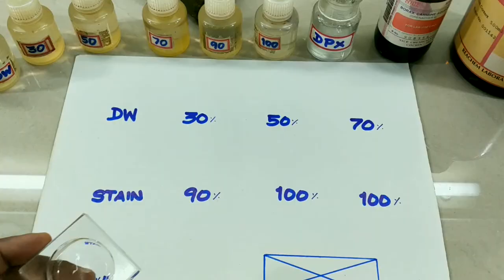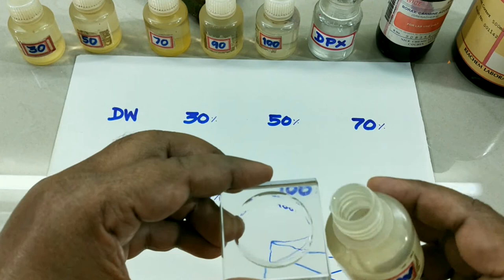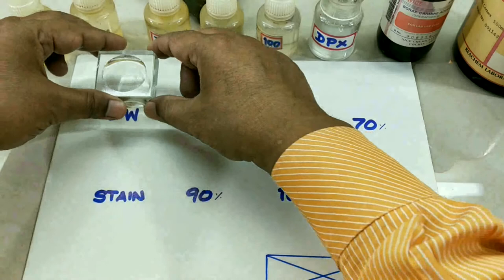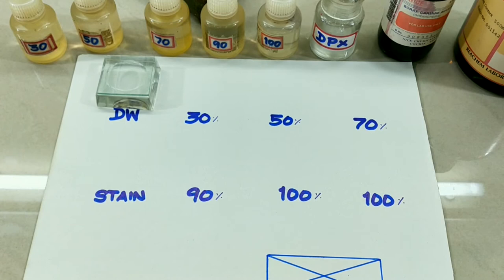Now take a cavity block, pour a little distilled water in it, place it in position, and cover with lid. Similarly, pour all the grades of alcohol and xylene in different embryo cups or cavity blocks and keep them in their respective places.